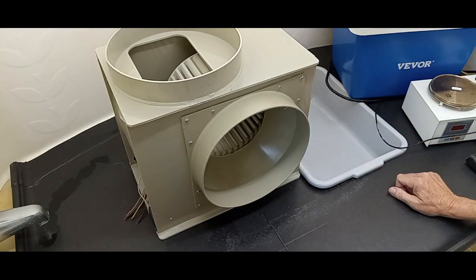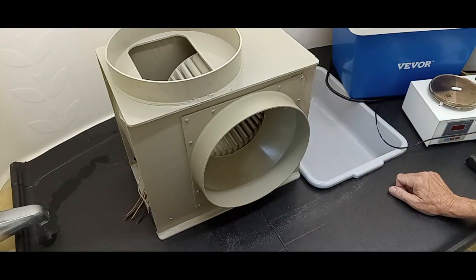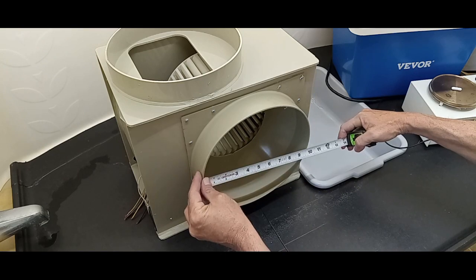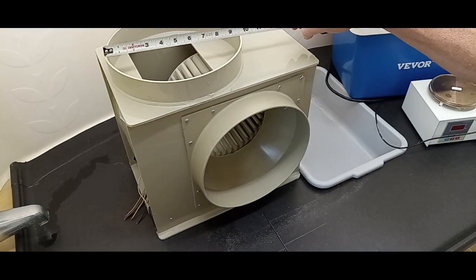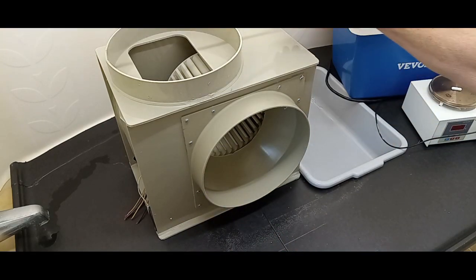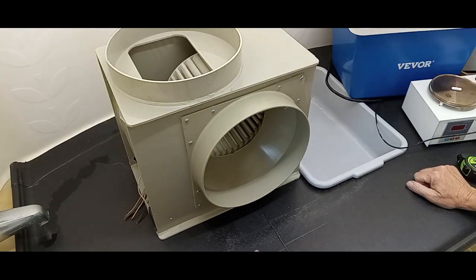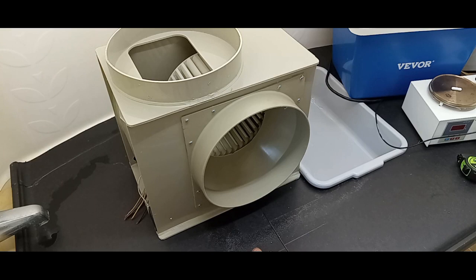So these are supposed to be 10 inches in and 10 inches out on the ducts, nine and three quarter, nine and five eighths roughly. I'm not sure how that's going to be compatible with the residential flexible ducting, but I'll cross that bridge when I get to it.